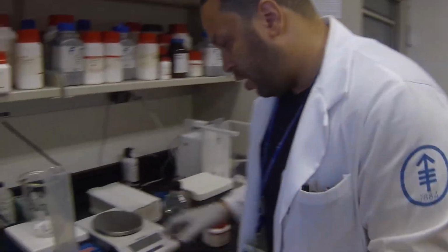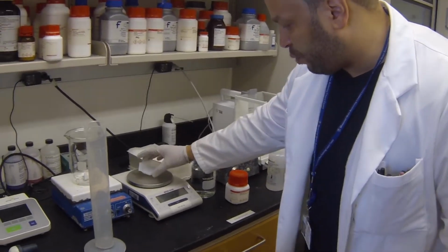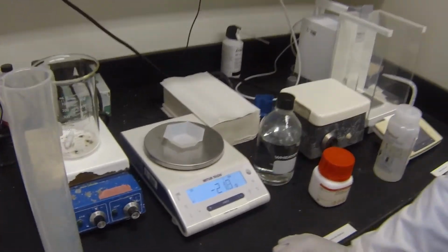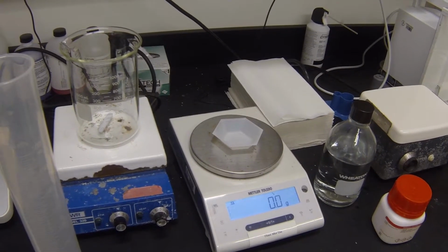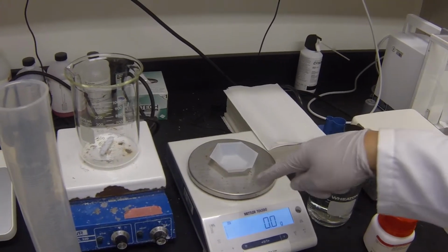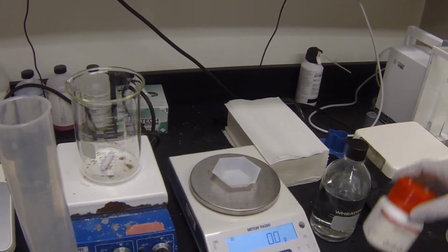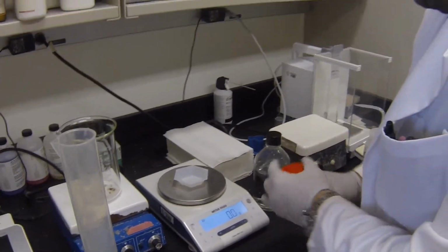So all we need to do is start mixing. We have a weigh station and a weigh boat, and we're going to put our weigh boat on and blank it, or zero it, or tare it. As you notice, it's not taking into account the weight of the boat, but only of our pure substance. So we're going to pour out until we see 22.2 grams.